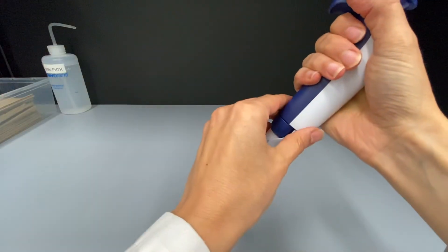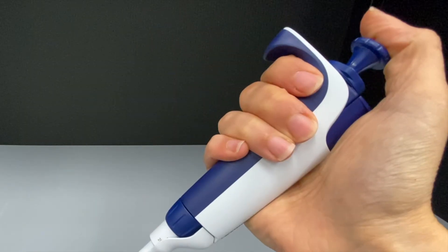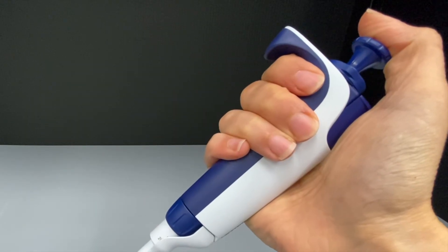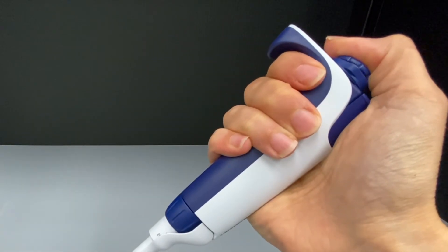The next step is to understand how the plunger works. There are three positions. First there is the resting position, the next position is the first stop and the last position is the second stop.